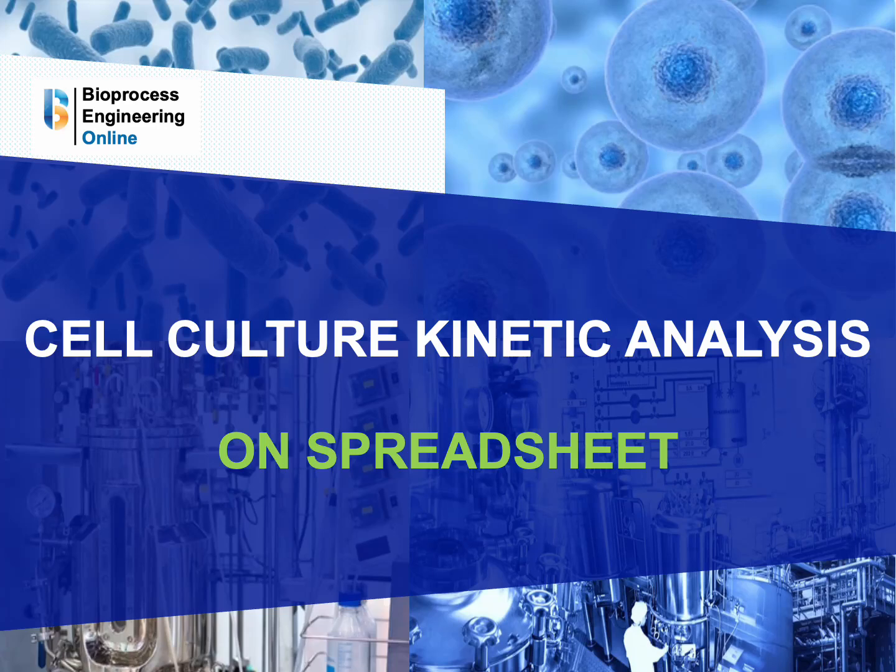Welcome to our bioprocess engineering online tutorial on how to perform a cell culture kinetic analysis on Spreadsheet.